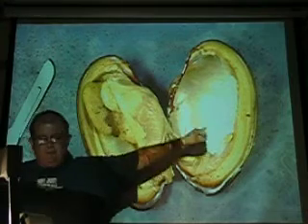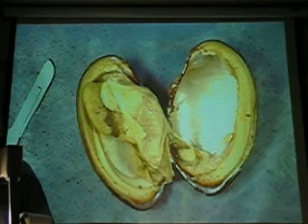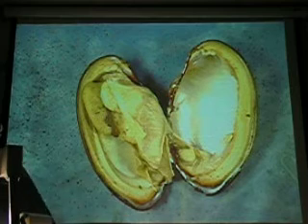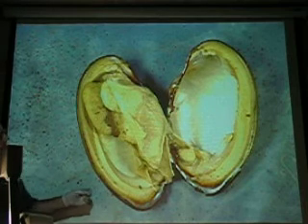A little butterfly presentation here. Why is it so shiny? What are we looking at? What's that shiny part? We're actually looking through a shell layer to see that kind of beautiful mother of pearl there. What is that layer? The prismatic layer. The prismatic layer. What layer are we looking through? What's the nacreous layer? The nacreous layer.